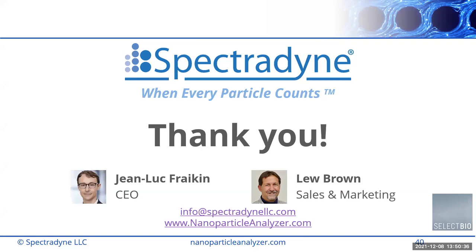I'm working at Corollas Munich, and I have a question on how the method itself is limited to particle shape. Is it for spherical particles, or is it also for long nanoparticles like, let's say, nanotubes?